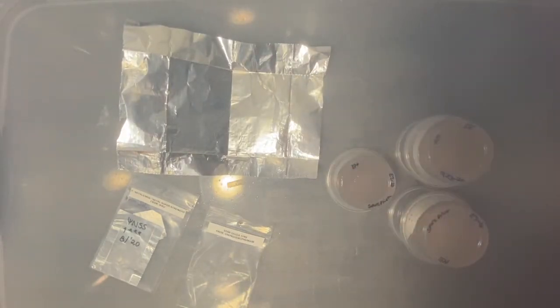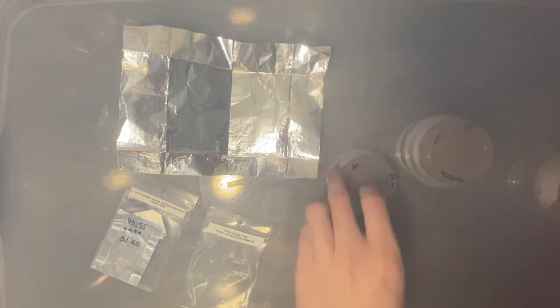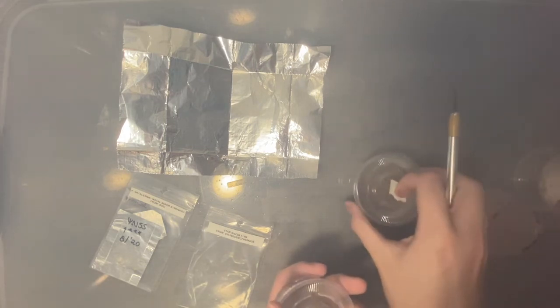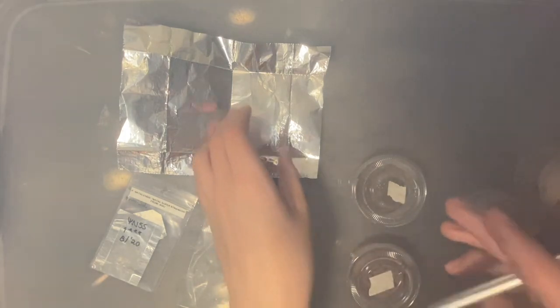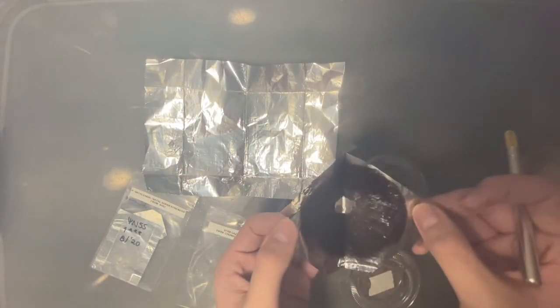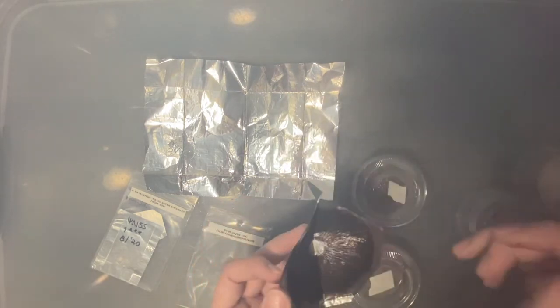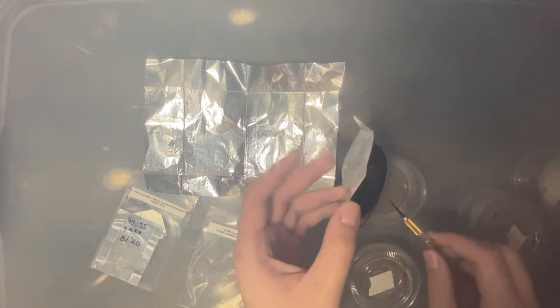3:15 in the morning. Alright, so we're taking Mr. Stargazer and popping the lids. And then we're gonna go ahead and take our print and examine it. Wow, that is a thick, thick print. I am impressed. Alright, and we're just gonna scrape off a couple spores.